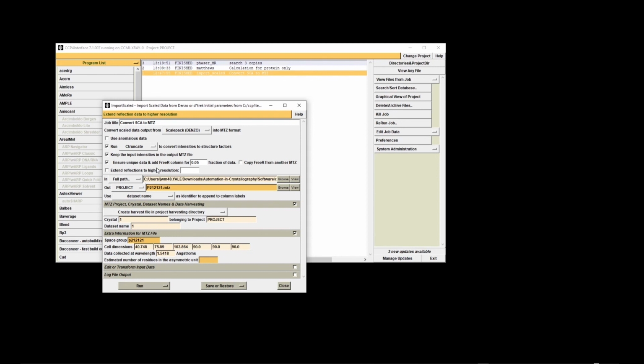And we're also going to add what's called an R-free column. Basically what that's going to do is assign a random number from 0 to 19 to each reflection, so that 5% of them will receive the number 0. That's used in a calculation later on in our structure where we determine R-free. Basically, an R value shows how good your structure is compared to your density, and an R-free value is where it keeps a certain set of your reflections separate and doesn't refine those. And then you can compare those to your structure, and those should also be the same if your structure is correct.